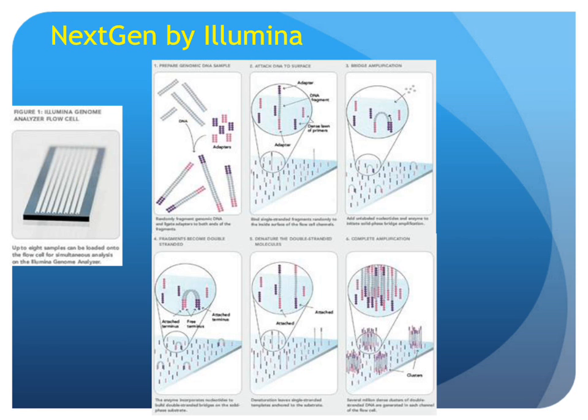The DNA fragments can bind to their complementary oligonucleotides, and the other end, which actually is then complementary to other oligonucleotides, can bend over, and what you have generally formed is basically a bridge and a template, and this can be copied. By doing this for a series of maybe 30 to 40 cycles, what you end up doing is making multiple copies of each individual template, so you end up with clusters, and on the whole flow cell, you have clusters of clusters.